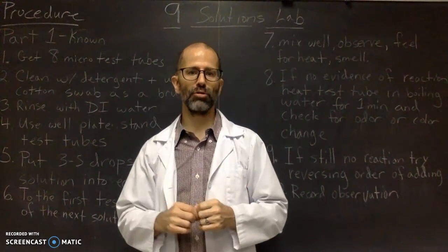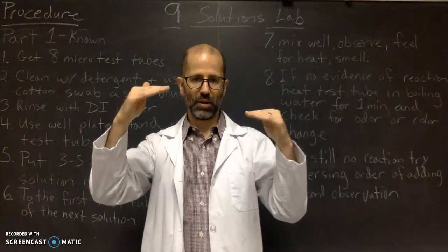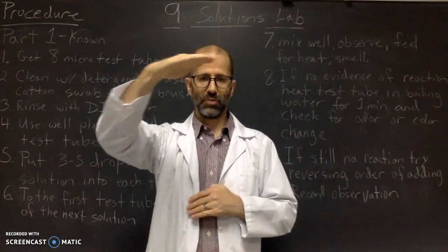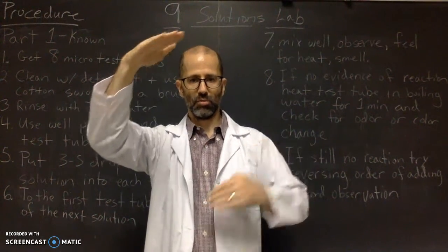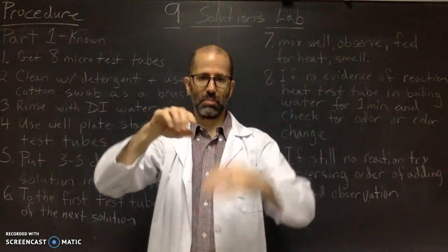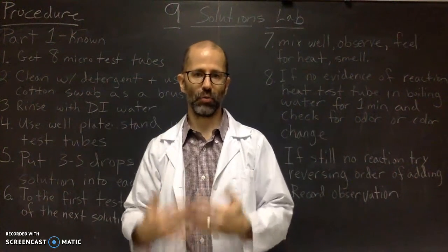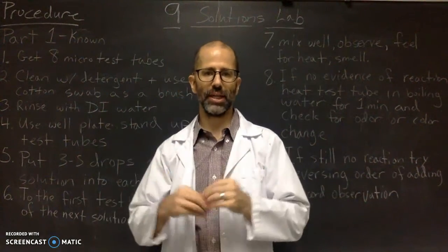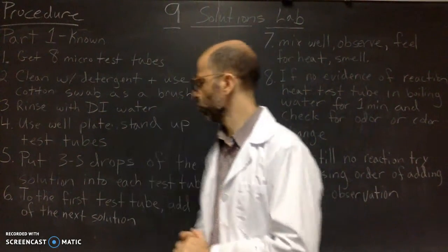So each time you do that, each square where they meet, so you're going to have the substances on top, and then you have these columns, and then you've got the rows, and where they meet, that square is where you're going to write your observations for the reaction. So you're doing this each time.